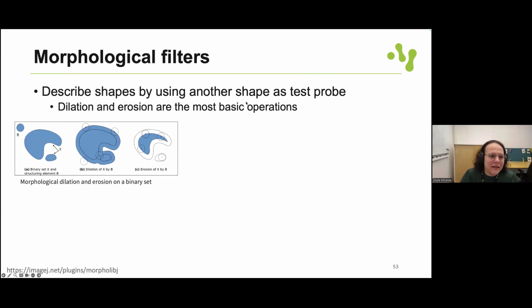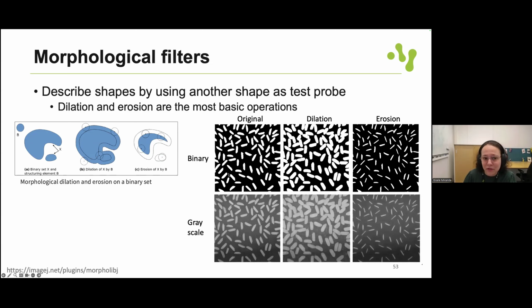Okay. So I will just go through the last class of filters here, and then we are going to talk a bit more on the workflow. Morphological filters can also help us detect shape. The common operators here are dilation and erosion. Here we have two objects, and if we apply what we call a dilation by B, which is also a type of kernel, then we can connect these two objects. The erosion can even delete some objects, because the kernel is almost the size of this other element.